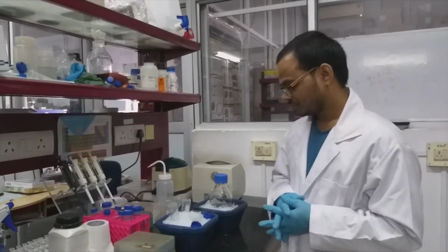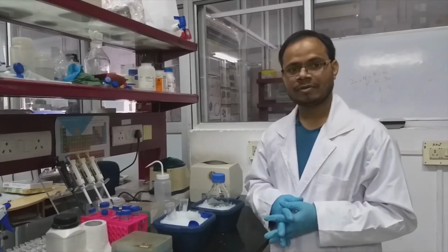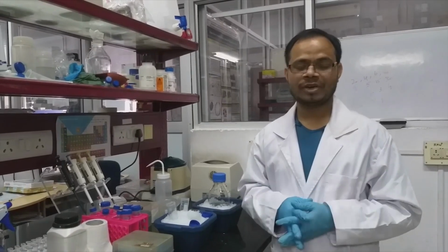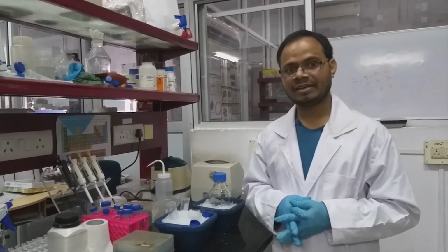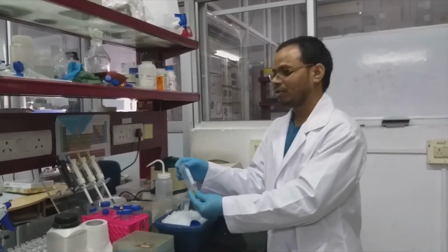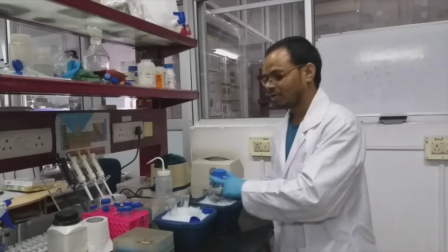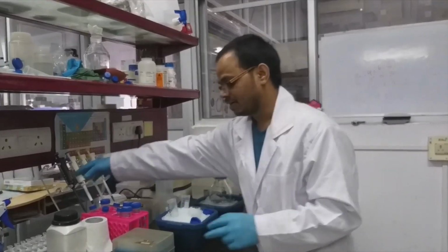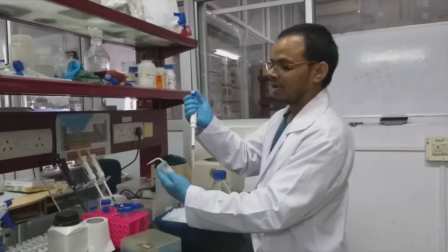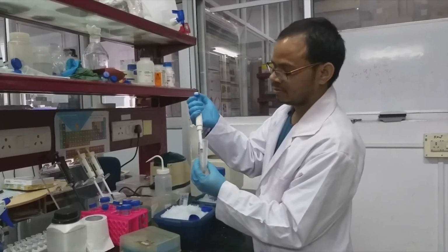Here this is a His-tagged protein. In further videos we will show how to purify this protein using a nickel NTA column. So for now, after pelleting down, we have to add lysis buffer to the cells and resuspend the pellet in lysis buffer.